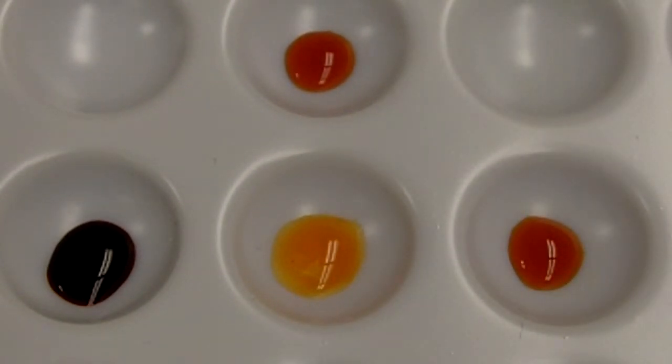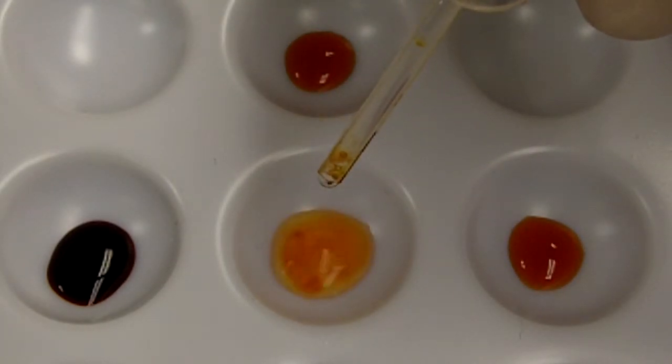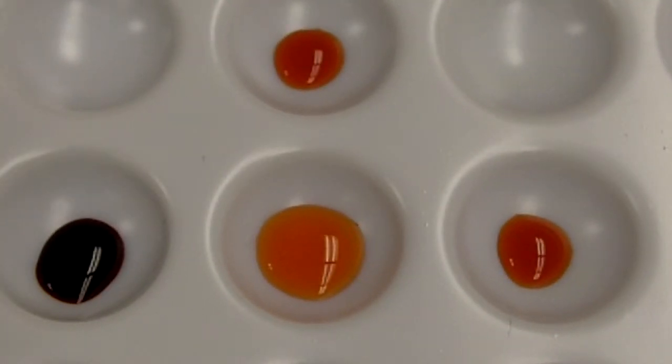And now adding the iron back to it, it looks yellowish right now. Now it has a definite orange color associated with it. So it was yellow, now it's orange. You want to think about yellow plus what equals orange.